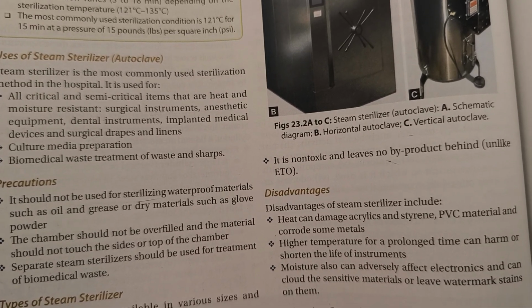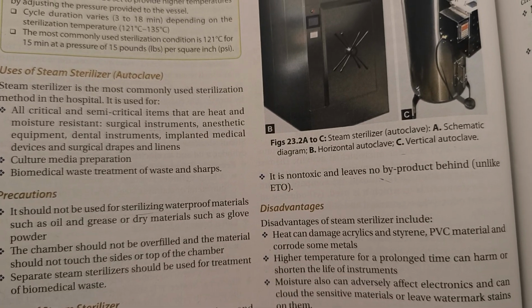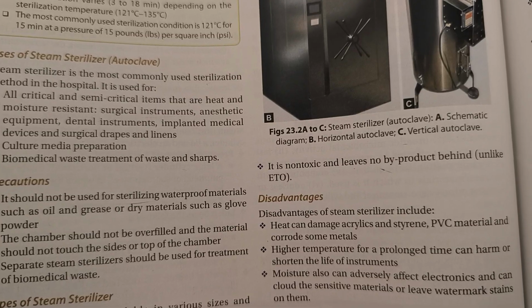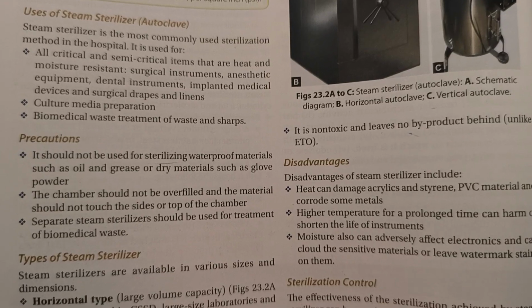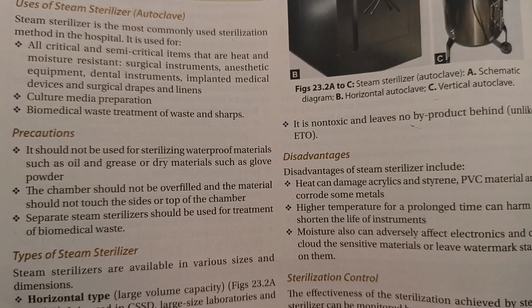The most commonly used sterilization condition is 121 degrees Celsius for 15 minutes at a pressure of 15 pounds per square inch, psi.